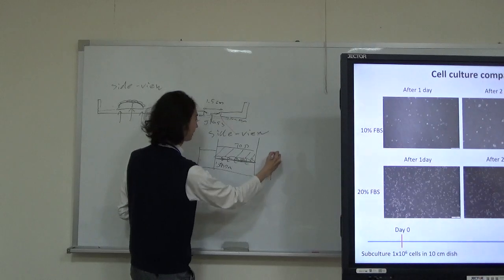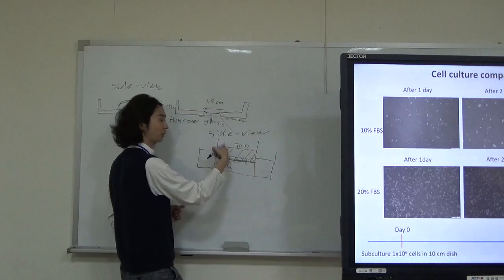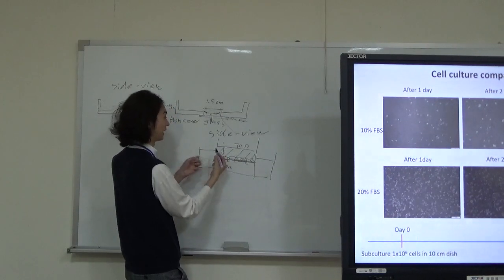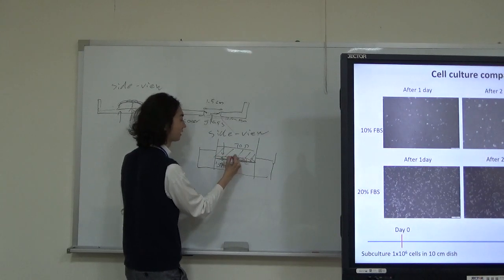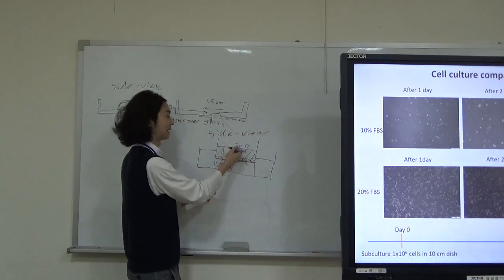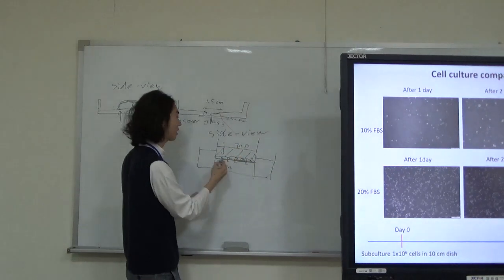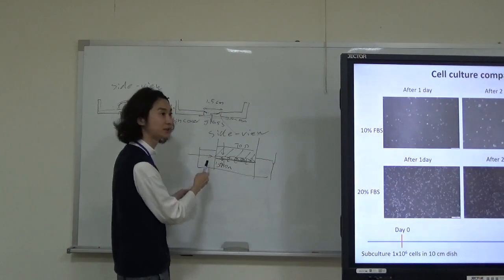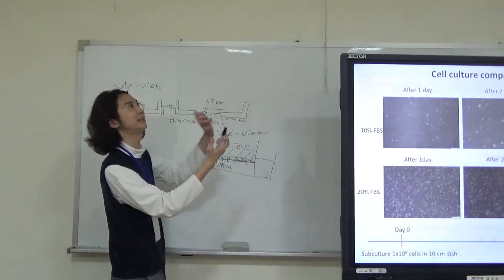In this state, we can analyze the incorporation from the top side to the bottom side, because it is divided by the Caco2 cells, and they make a tight junction, and materials only pass by incorporation. But thus, we need the cells to differentiate into incorporating cells.